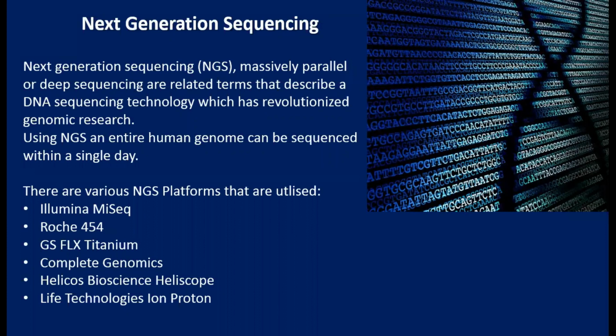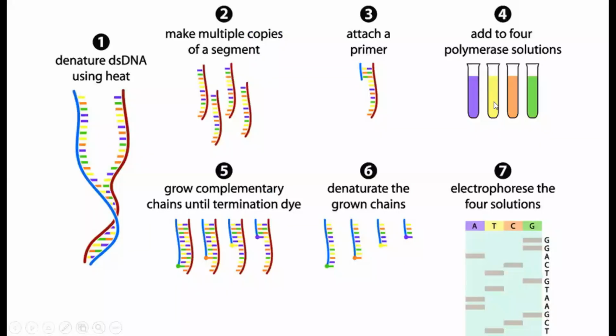Now, the Sanger process was really effective for a long time. But another major issue with Sanger's method was that you're having only 4 test tubes, and in each test tube you can only add one type of ddNTP. You can't add a mixture of ddNTPs. Again, your process became slowed down, right? Because for each individual ddNTP, you have to wait for the reaction to happen.